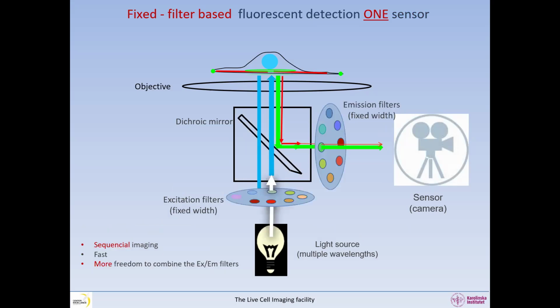In the most modern systems, the excitation and the emission filters are moved out. They are not anymore in a cube.